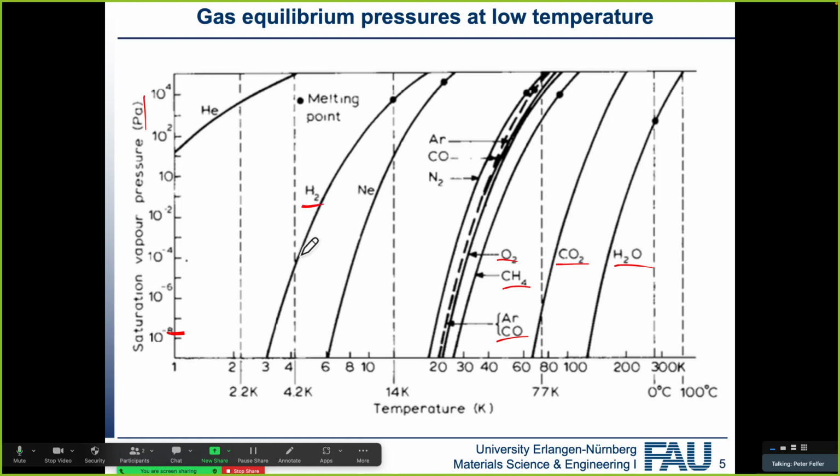The reason for that is that we usually use stainless steel chambers, and the hydrogen comes out of the stainless steel. But essentially, the further up we go from here, the worse our contaminants get. You can imagine what's probably worse than H2O. These are all surface-sorbing species, so the larger the molecule, the less it will want to evaporate, because we're mostly talking about van der Waals forces. H2O is bad, but with hydrocarbons, if you have any oils, for example, it gets even worse, because they want to evaporate even less.